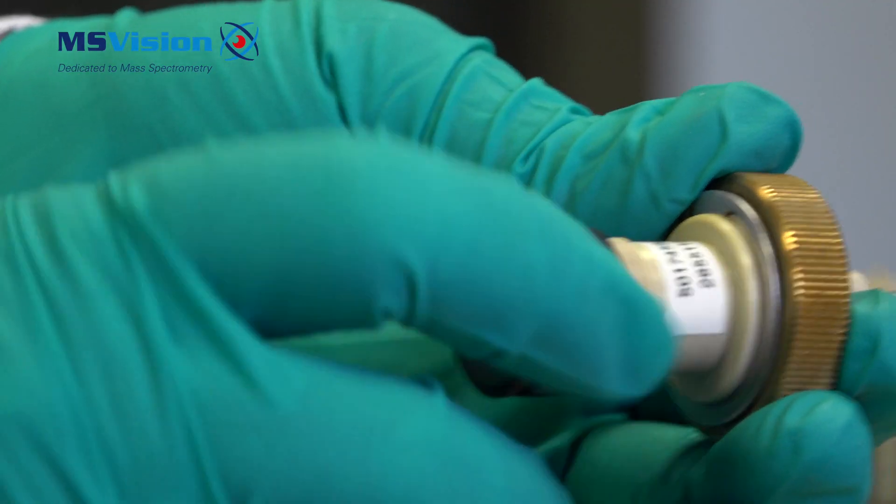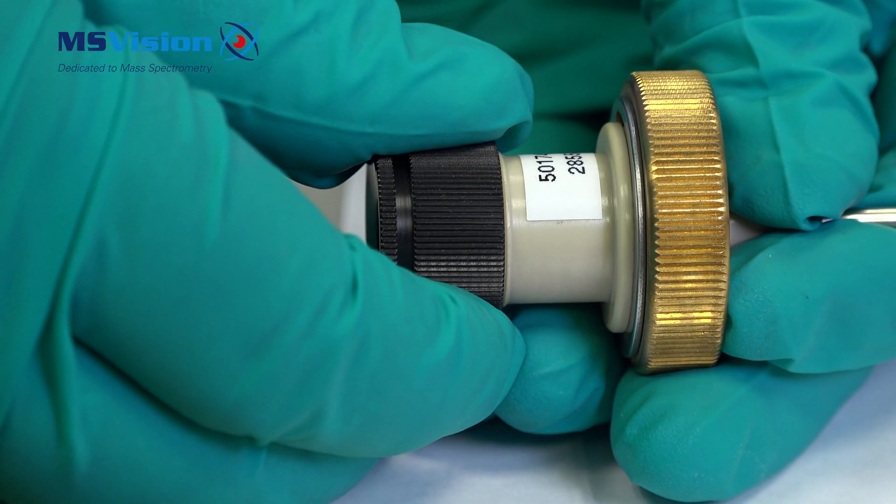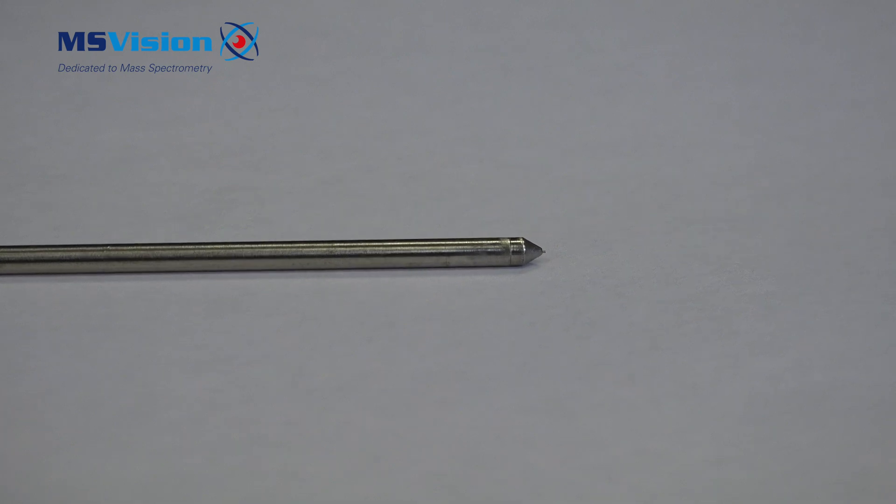Screw the black cap on and use it to adjust the position of the capillary tip to be approximately one millimeter out from the probe tip.